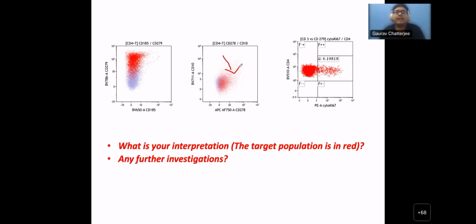So now can anyone tell me the diagnosis? What is the diagnosis now? Lina, can you tell me? What are these markers like CD10, ICOS, PD1? Have you heard of them in the context of T cells? What do they indicate? No, sir. Okay, that's not a problem at all. Ankit or Vats, anyone else? Aishwarya? It is a T follicular helper cell lymphoma. Who is this? This is Lina, is it?